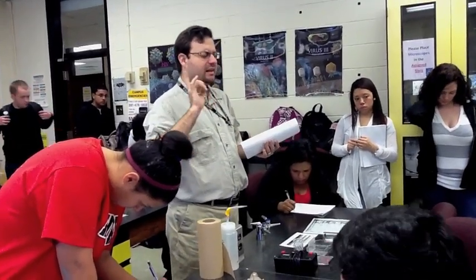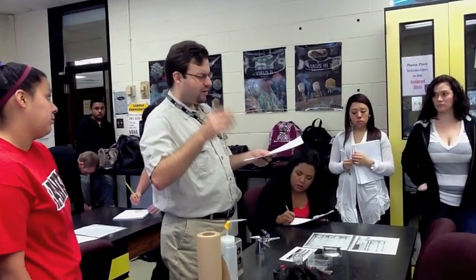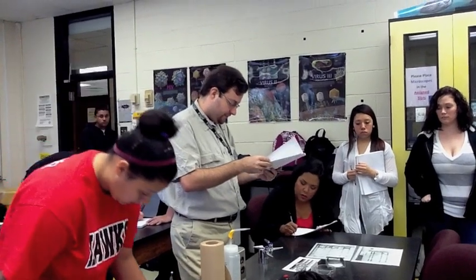The only other thing that I'm not sure if I told you: do you remember the liquid on top of the gel? That was called TBE buffer. For some reason that always pops up on the test, I don't know why. The last thing you'll need to know is how the DNA strands are separated. It's done two ways: one by size and two by charge. Remember that example I gave of the semi and the motorcycle going down the congested highway.